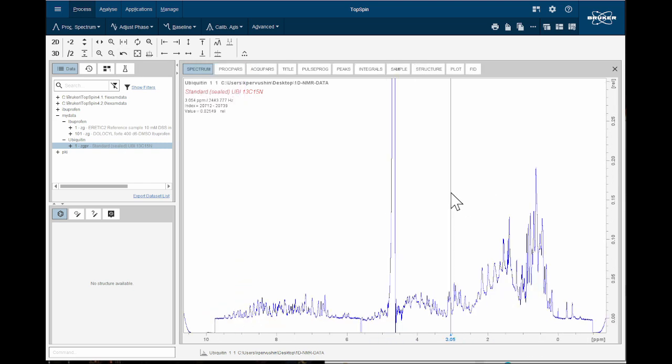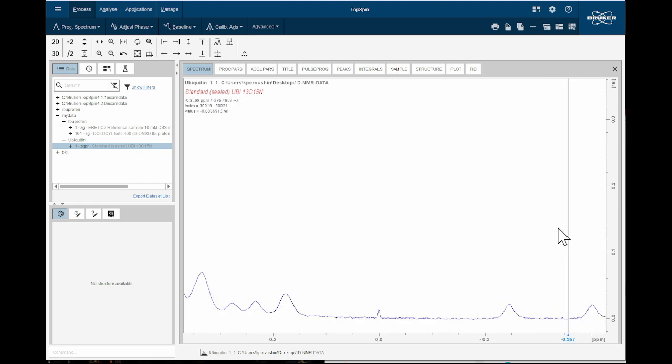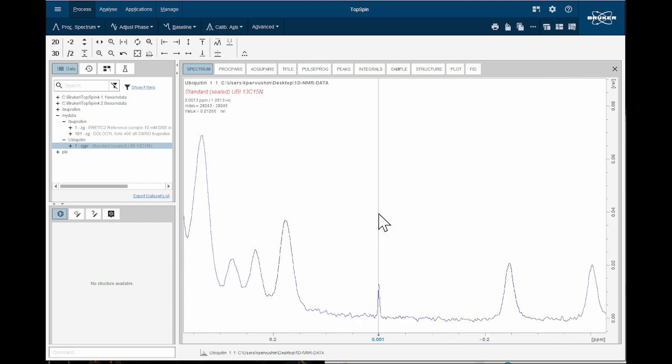Okay, so here is my spectrum. As you can see, I corrected it in two bands, band 1, band 2, because the baseline was wiggling a little bit here, so I cannot use just a smoothly declining or inclining baseline. So now I have to chemical shift reference it, and that little signal is my DSS. Here it is, 0 ppm.